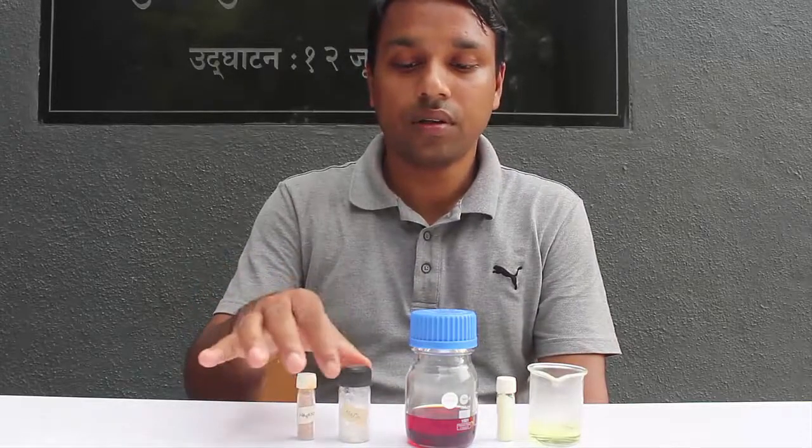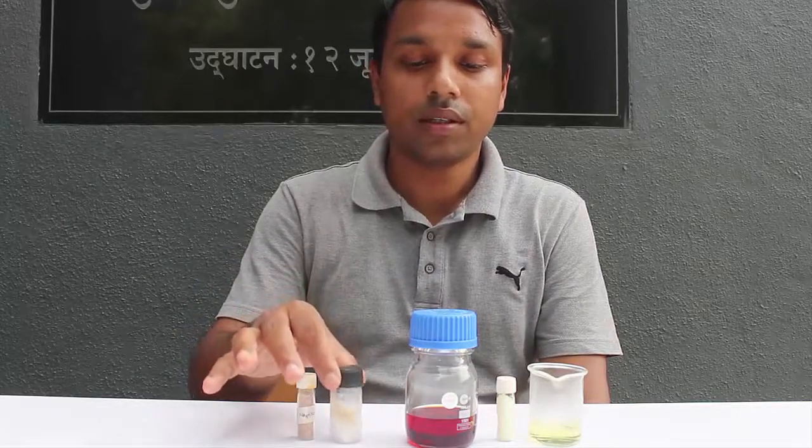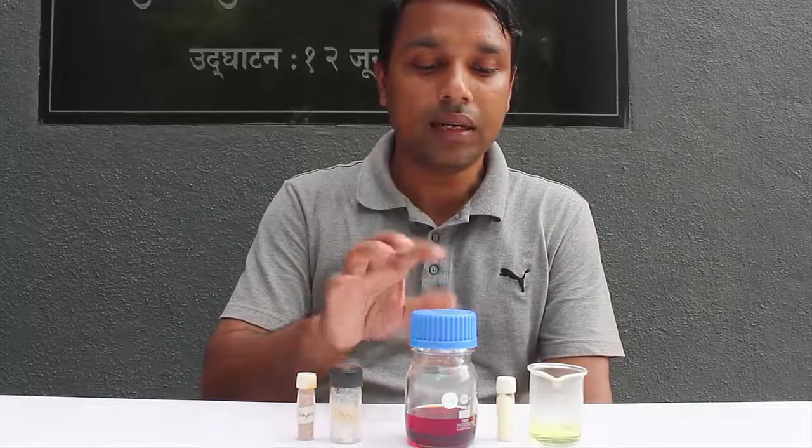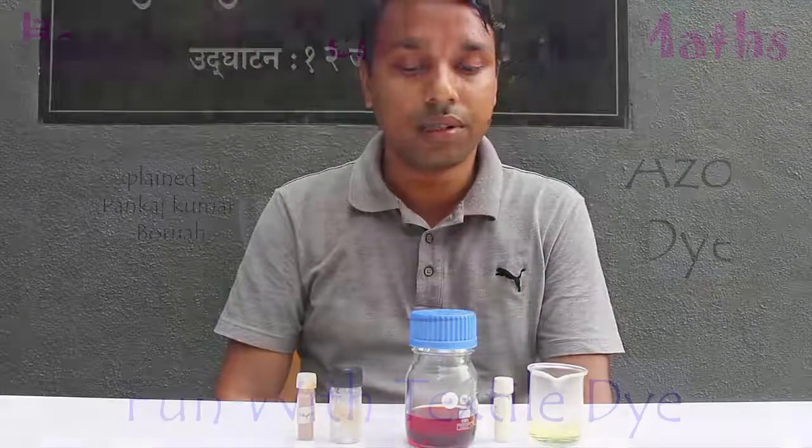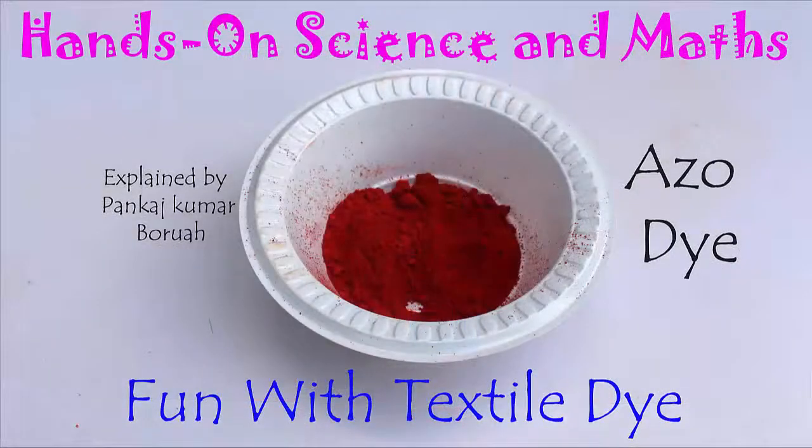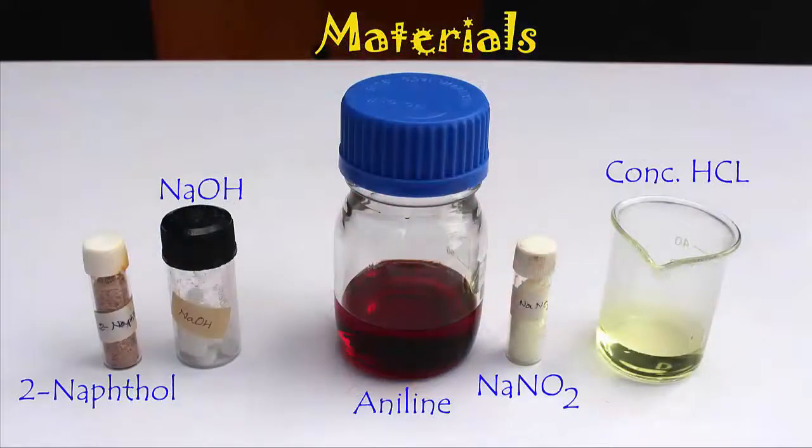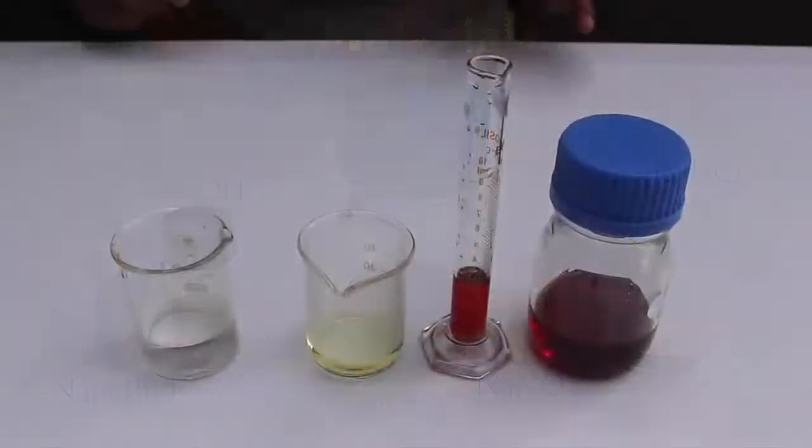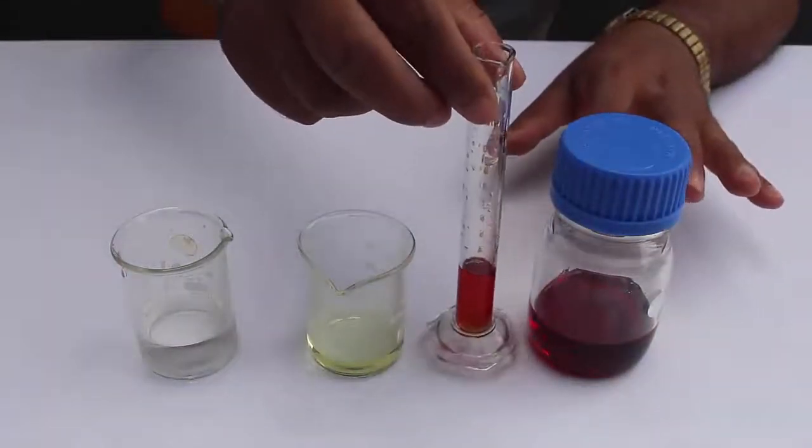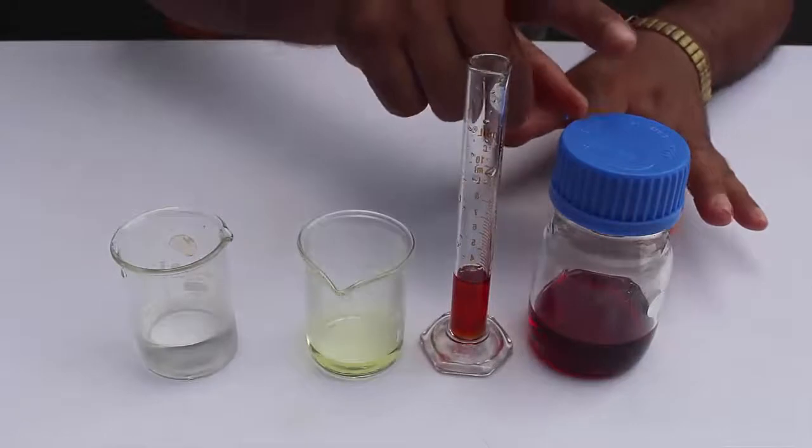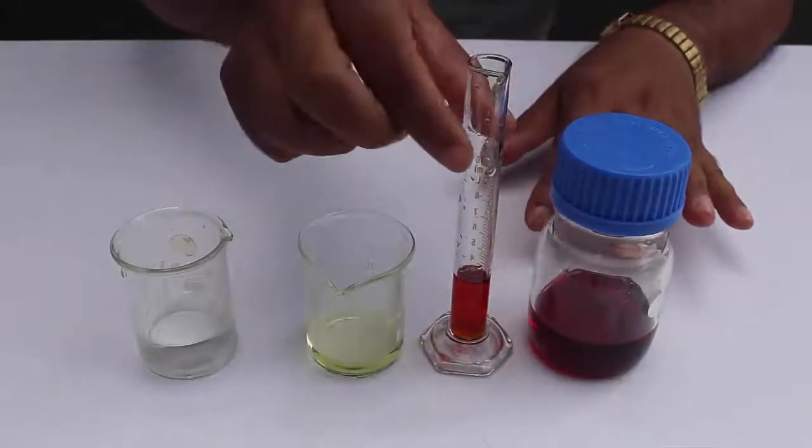We need some chemicals: 2-naphthol or beta naphthol, sodium hydroxide caustic soda, aniline, sodium nitrite, and also concentrated hydrochloric acid. So this is how we make the azo dye. First, pour out 4 ml of aniline in a measuring cylinder.